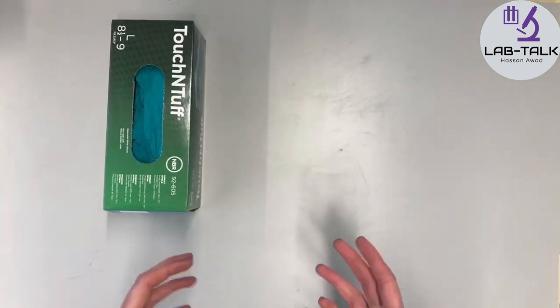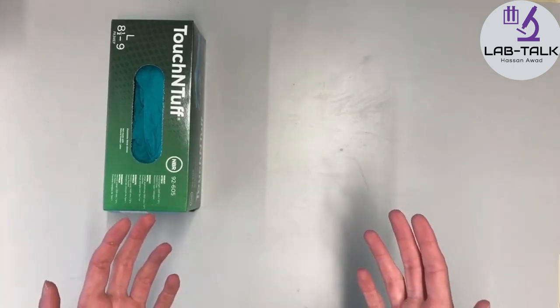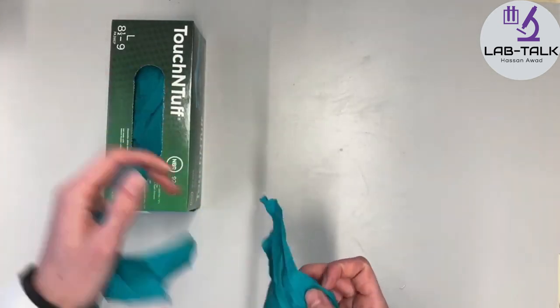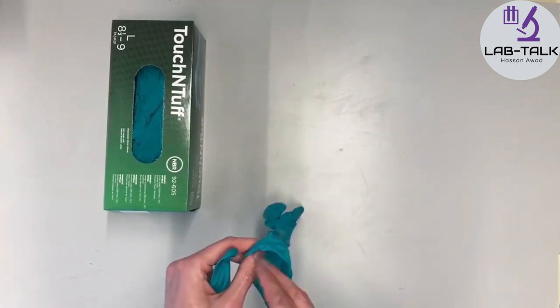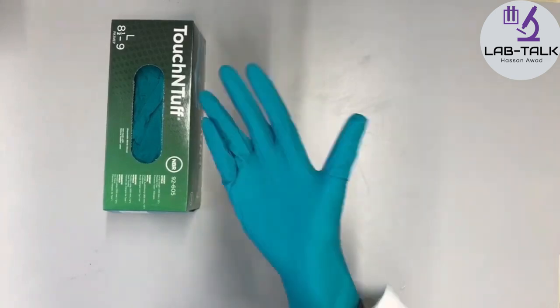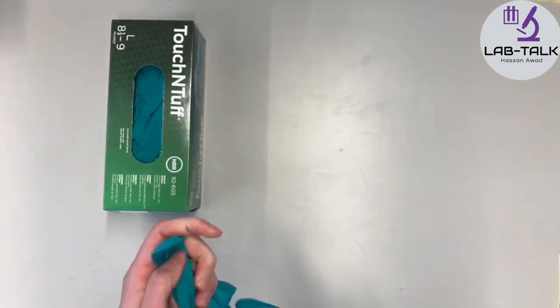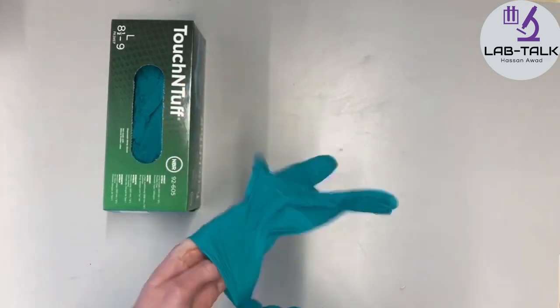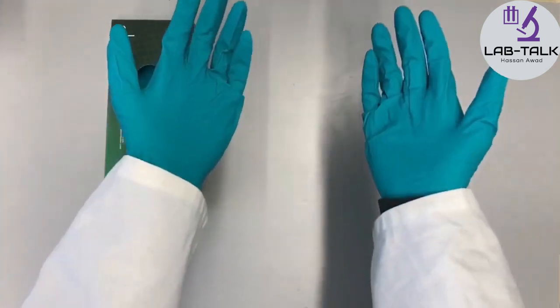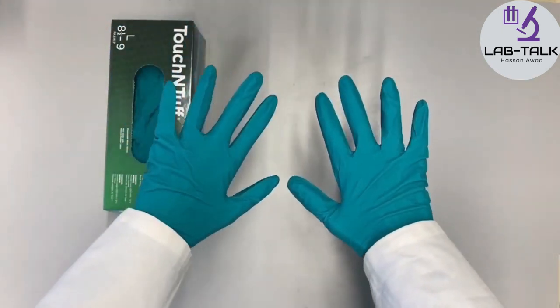When you start working with chemicals, and only when you work with chemicals, you can put on gloves. Just take two from the box and put them on your hands. The ones we have have a designated thumb, so place the thumb in that part. Now my hands are protected against chemical spills.